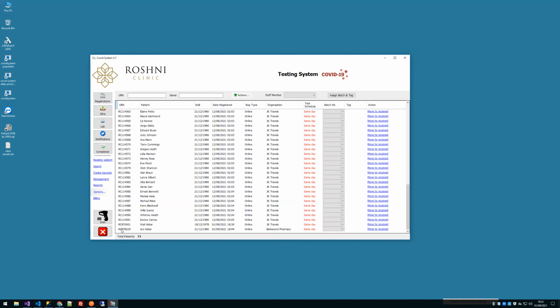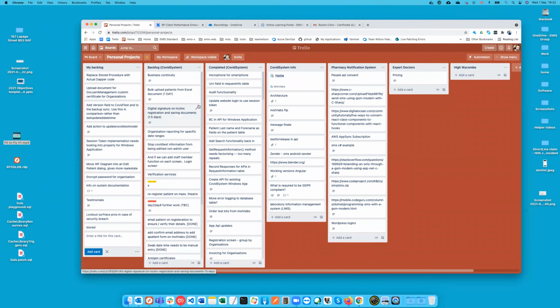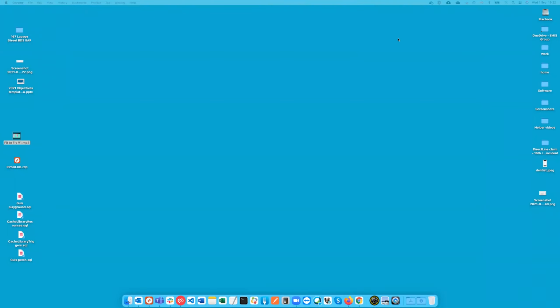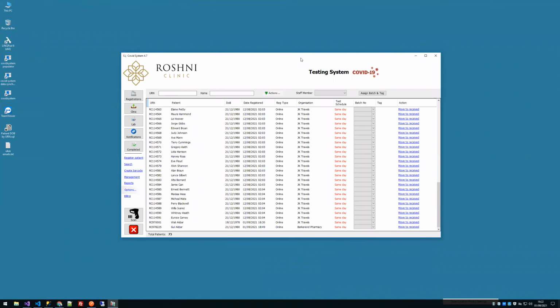Like I say, I've been off for a couple of weeks or so. It's coming to my third week now. I've been away, and I wanted to get these things. I've got a big backlog of stuff that I need to do, just so that you're aware. But yeah, go back to, oops, wrong one. So there's loads of stuff going on in the background.